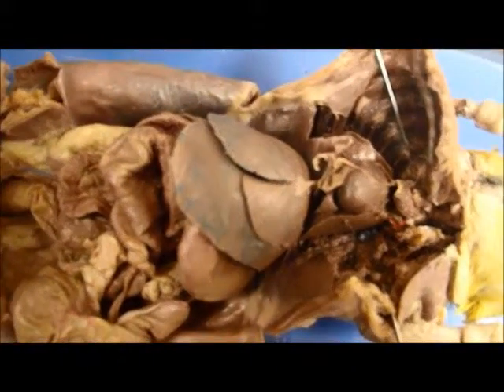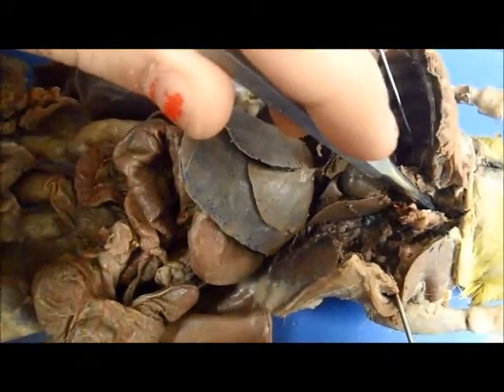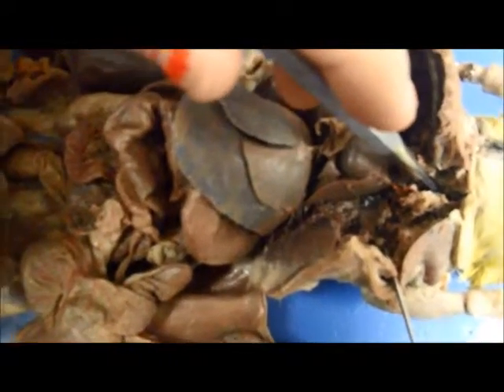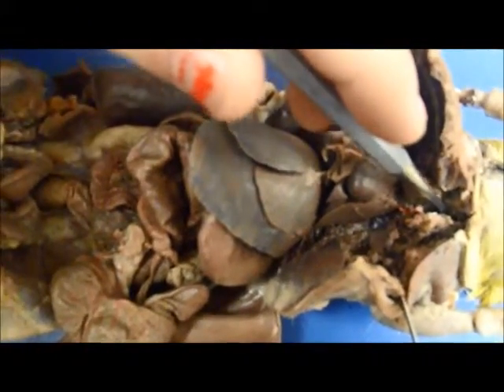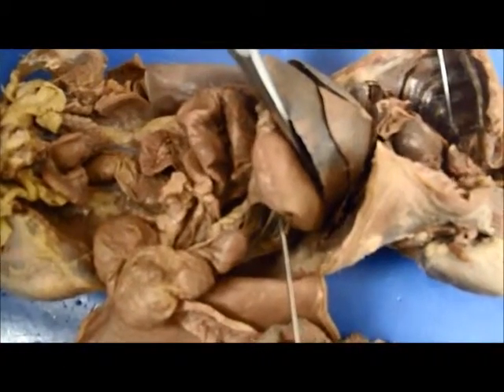Now we are going to show you the digestive system. Up here in the throat, we have what's called the esophagus. It pierces the diaphragm and moves food from the mouth to the stomach. It is easiest to locate where it enters the stomach. Next, we have the stomach right here, which is located on the left side under the diaphragm.